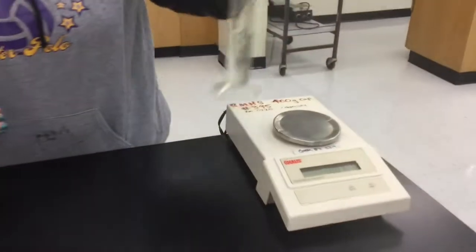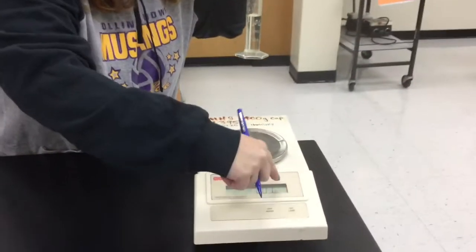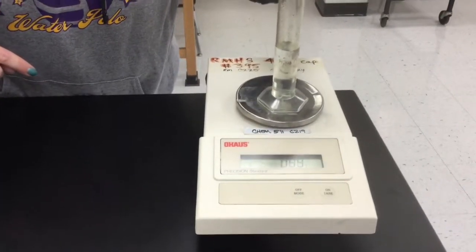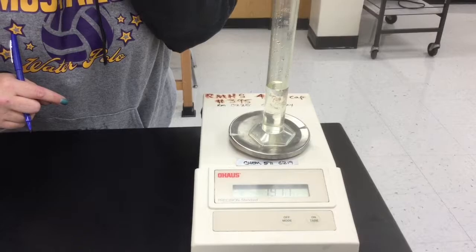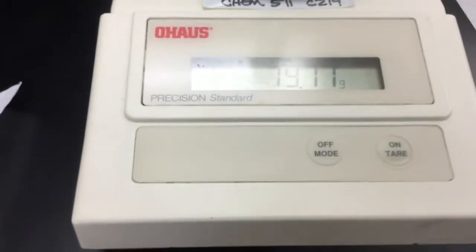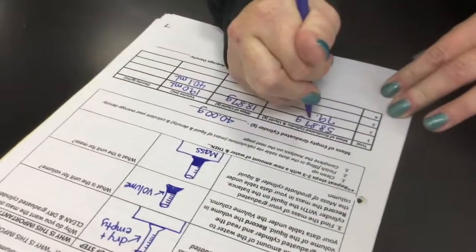All right. Now we mass, but wait. First, I have to tare the balance. There was a 0.01 there. Oh dear. Oh gosh. All right. Okay. 79.71. Right? Yep. Okay. 79.71 grams.